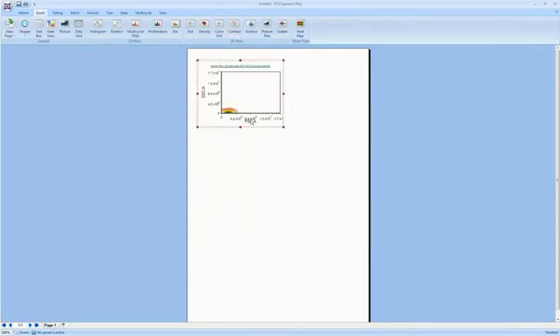And it opens up with the forward scatter and side scatter, and I can choose any of the parameters. Now this data file did not have labeled parameters, so we're just getting FL3 and FL2, not very useful labels, but it gives you an idea for what's here.